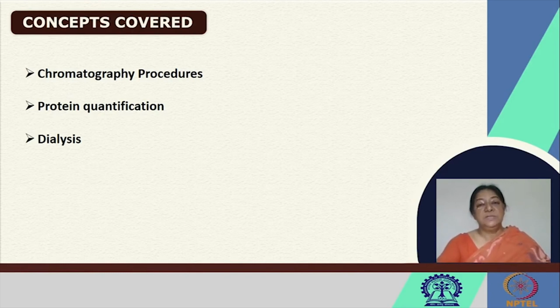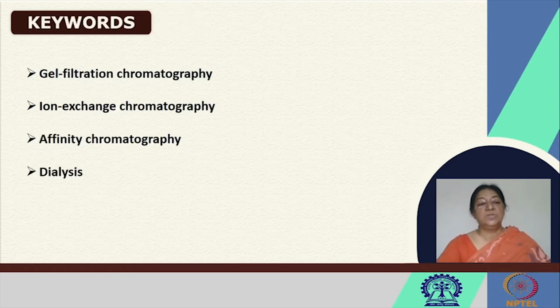Our interest is our protein, the specific tissue or the microorganism from which we are going to isolate this protein. And now we have a crude fraction of the protein. Our next idea is to look at this crude fraction and, following a specific protocol, exploiting a specific property of the molecule, go for specific procedures to get to our final protein.